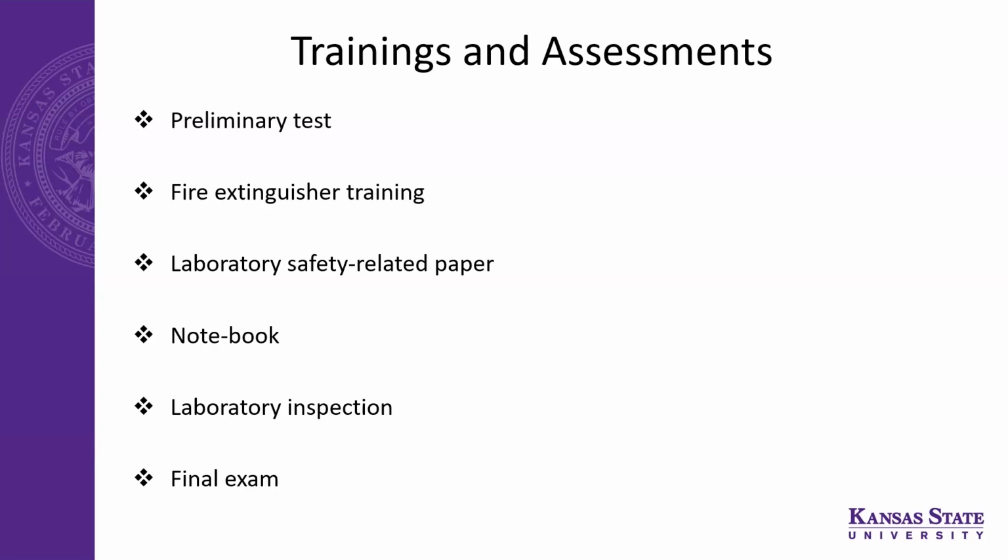Once I'm done with teaching, we take a week to go around the labs in batches. I ask them to sign up in groups of 2-3 people, and we pick a couple of labs. I pick the most chaotic labs so that they can find the violations. This is not like an exam.